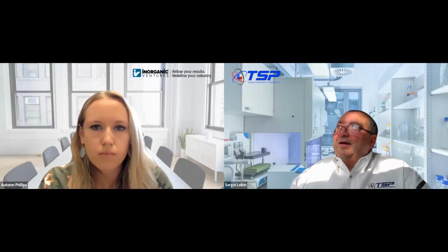All right, and very last one. You shouldn't do the bullet test with ICP-MS, right? Yes, the bullet test is more related to ICP emission. You don't need to run a concentrated solution into the mass spec. That's quite a bit, especially if you're using yttrium as one of the internal standards. So that's actually a good question.